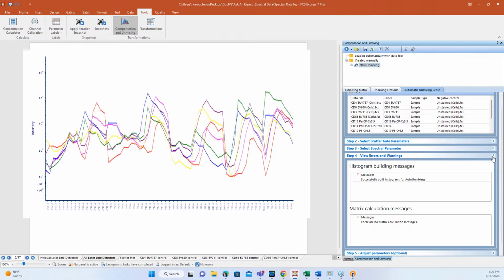Yeah, and one of the messages that often comes up in this window, as we're speaking about errors, is sometimes you can have a message that something is showing up in the same channel, right? So you'll get a message that this and this are showing up in the same place, so that the peak channel is being chosen as the same for them.